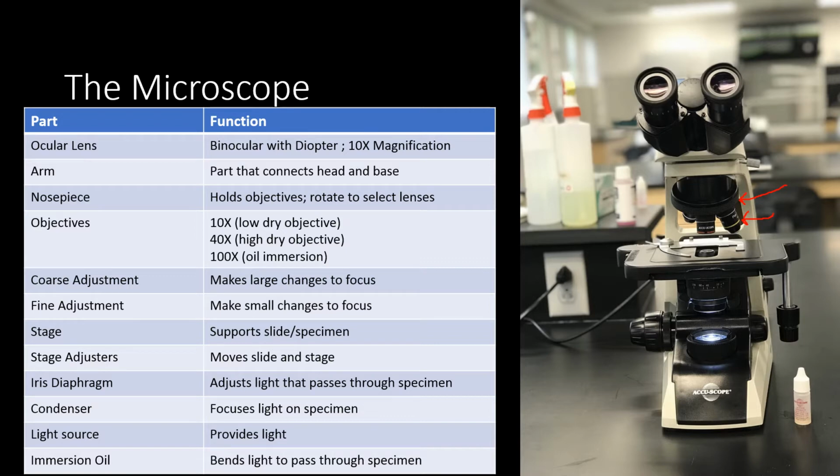I'll tell you, for microbiology, I don't find this lens to be particularly helpful, but it's good for finding your specimen across the entire slide. I find it's more useful when you're looking at eukaryotes. It's good for finding larger specimens on the slide.